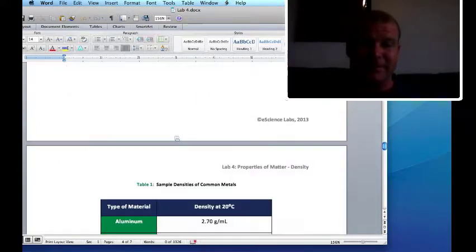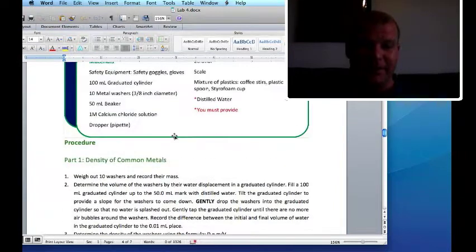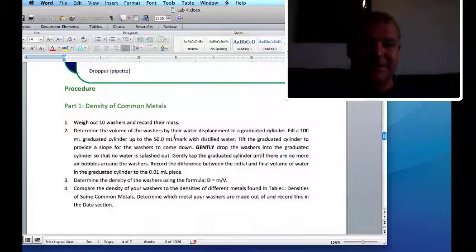So we've already talked about density, so you know about density. Oh yeah, we should talk about how to weigh this out. So take washers. The idea is we're going to figure out how much the washers weigh, or as my father would say, the warshers. So let's weigh out 10 warshers and see what their mass is. Sorry, I'll do the proper.